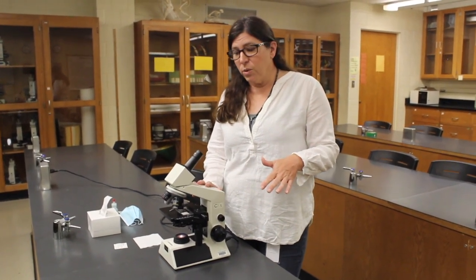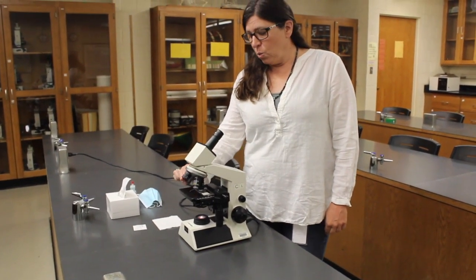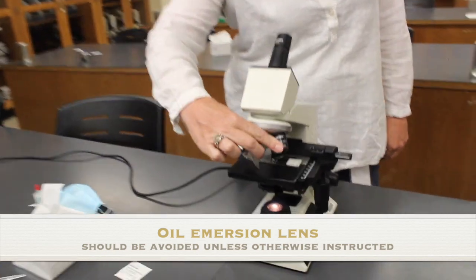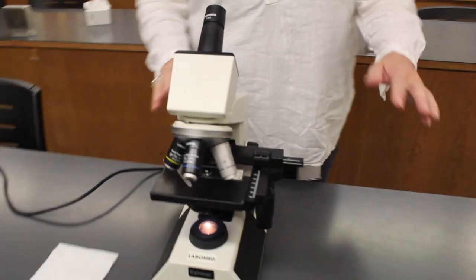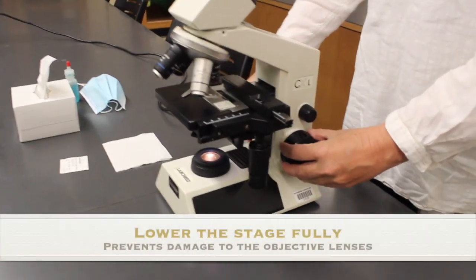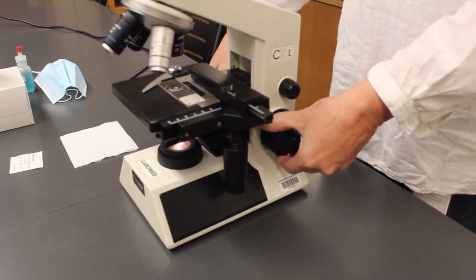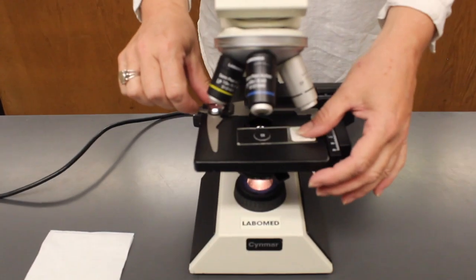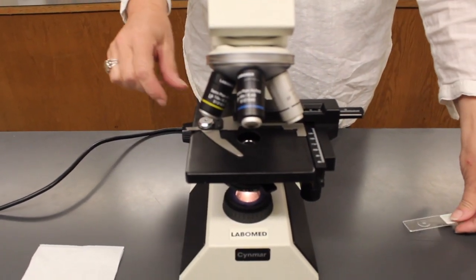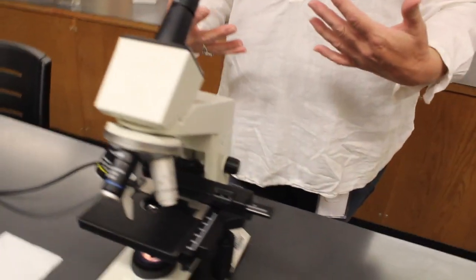Now we're going to learn how to take the slide off. And the first thing that you have to do is put it back on low power. Since we're not using the oil immersion lens, we really want to go backwards the way we came. So clicking through medium and then down to low power. At this time, you're going to want to lower the stage down using that coarse focus till the stage is all the way down. And then we can take our hand and open up the lever arm and gently slide the slide off of the stage and put it on the desk. And you're done with removing the slide.